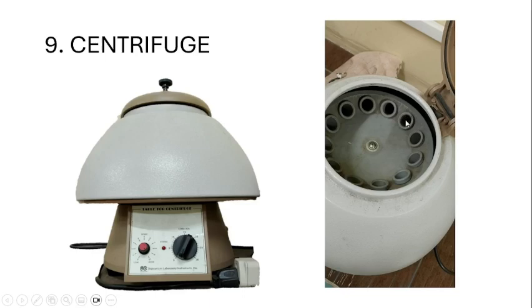So in using the centrifuge, this should be balanced. So if in case the number of test tubes do not suffice, then you will be using a blank solution. So it's basically just a test tube with just water to replace, so that the weight of this centrifuge will be balanced. Otherwise, if it is not balanced and you turn it on, then the test tubes might break.